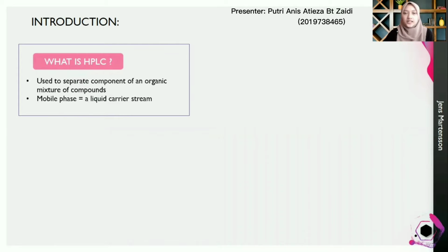HPLC is an analytical technique used for the separation of components of an organic mixture compound. The process begins when a small amount of liquid sample is injected into the column that has a stream of liquid flowing through, which is known as the mobile phase.